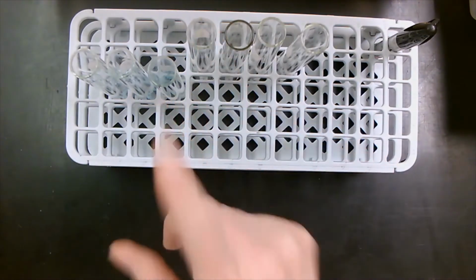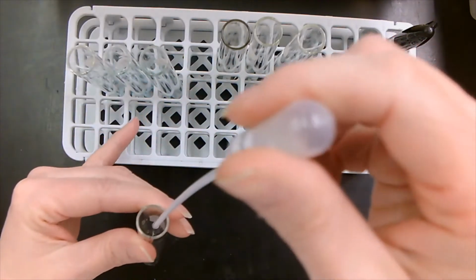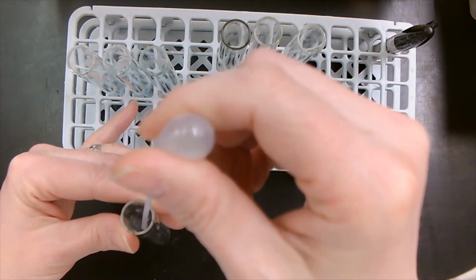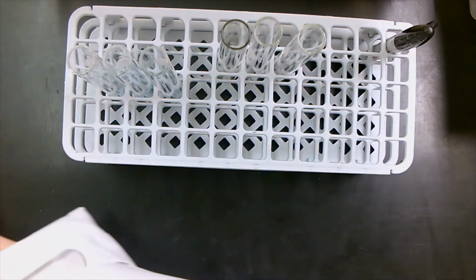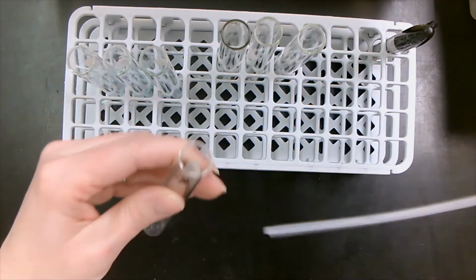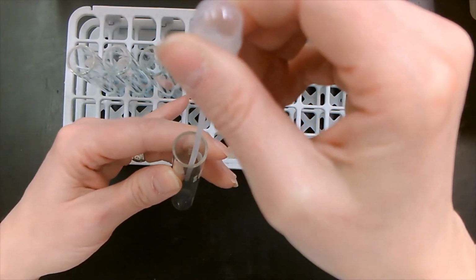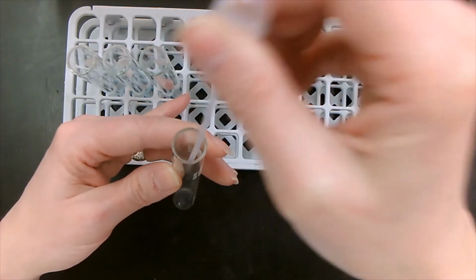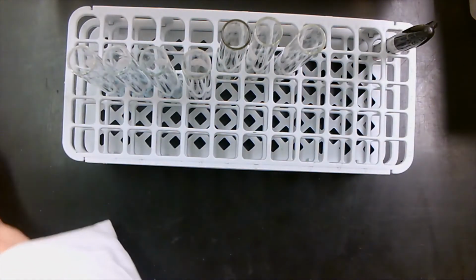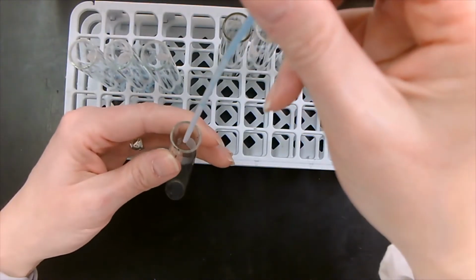For the next test tube, we are going to be testing starch solution again. So I'm adding my 5 drops of starch. But we are also going to add 2 drops of hydrochloric acid. And this is to try to see what would happen if we tried to break down the starch. Now I'm going to be adding our Benedict's to it.